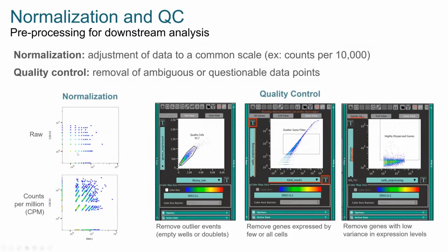And so all it'll do is just adjust the scaling. So if this is the raw information, you can see all that data has just shifted over to the right to a larger scale rather than being crunched here on the axis and not really capturing the range of the information because some samples might be getting cut off. Okay. So it's just going to put everything on an even scale.